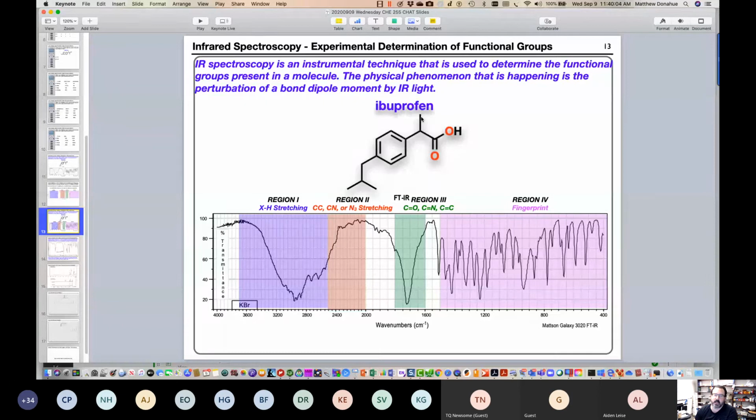All the different CH stretching. You have this methyl group, this methine, these benzene ring CH stretchings, methylene, methine, methyl. All those different types of CH bonds occur in this region. So it's really hard to ferret out that it's specifically those types. So what this region 1 tells us is that, okay, there's OH, because we see a very broad peak shape. And again, I will go through all the different functional groups in a separate lecture screencast so that you can pick out the diagnostic peaks.